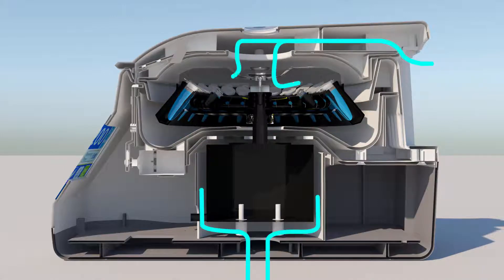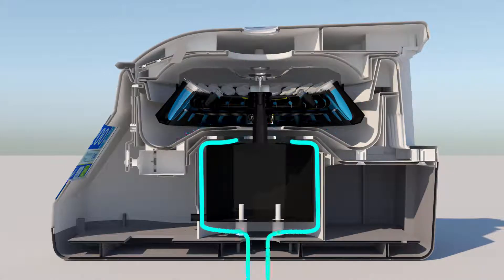The MC24 Touch also utilizes a unique airflow system to keep samples cooler, even during extended runs at high speeds.